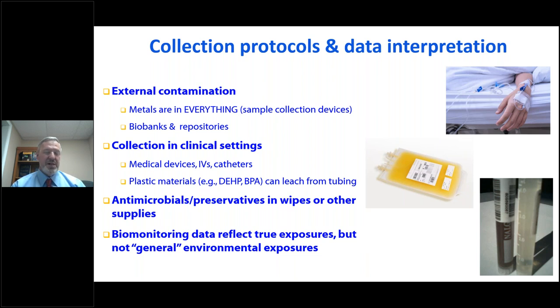Collection materials for medical devices, IVs and catheters, we've seen some very serious contaminations with that because we can't control those. But we looked at the actual IVs and catheters to find certain contaminants in them. From the organic standpoint, you can have plastic materials that can leach from various tubings that can offset your biomonitoring results, and antimicrobial preservatives and wipes or other supplies could have contaminants.